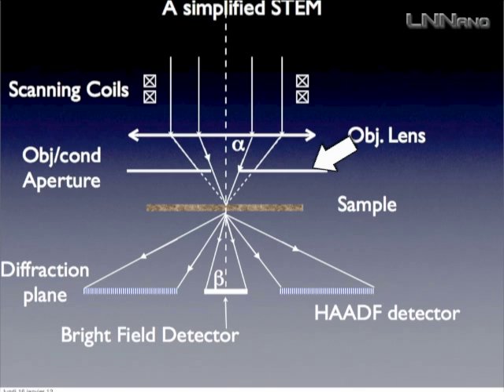an aperture that, in the STEM language, we call the objective aperture, but in most commercial TEMs is called the condenser aperture. So you might know the condenser aperture much better than the objective aperture in this situation.